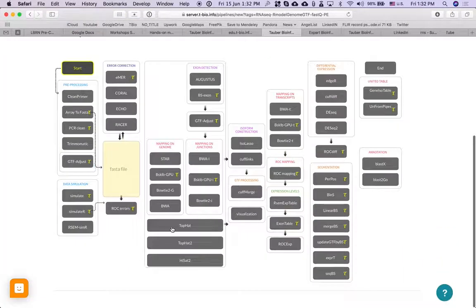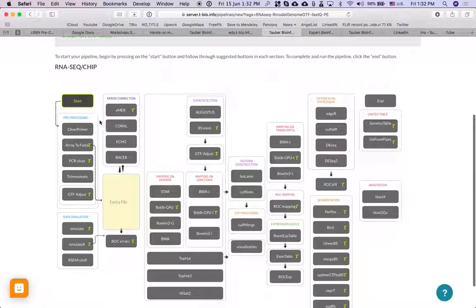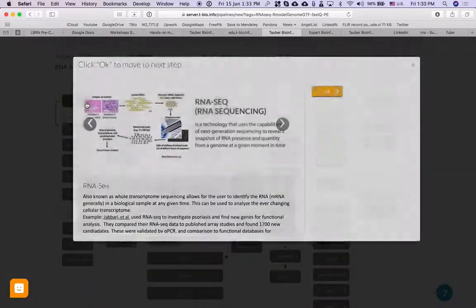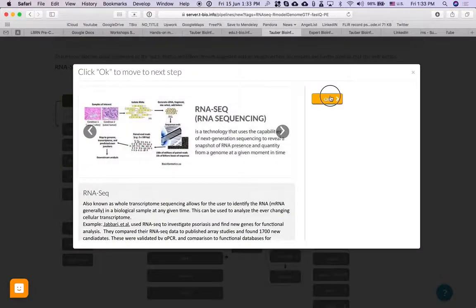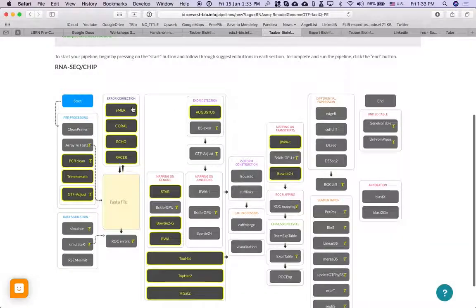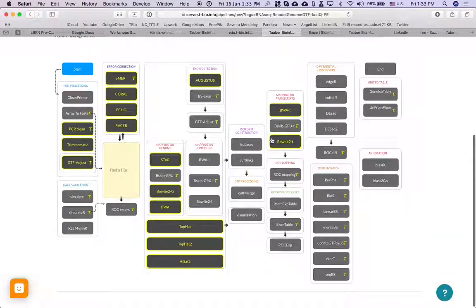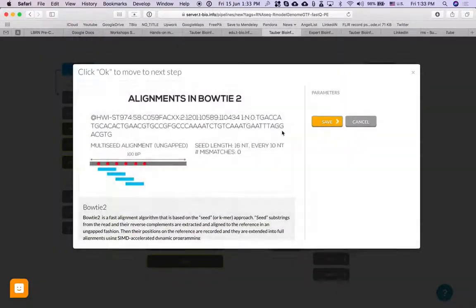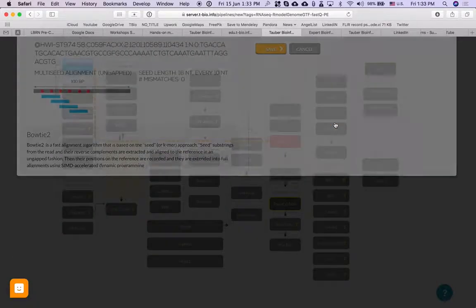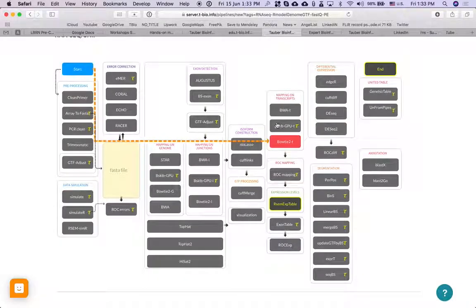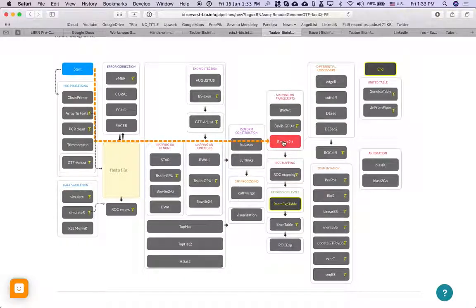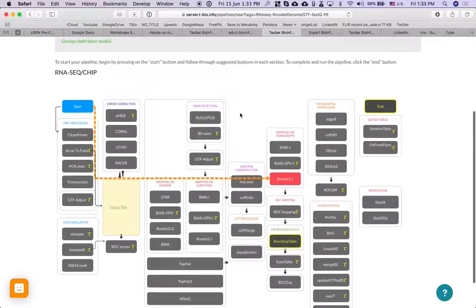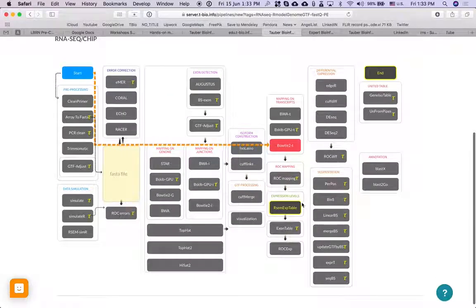And then what I'm going to do is cancel, no groups. So this is what the pipeline should look like. Start, Bowtie2t. I'm mapping on known transcripts that are already in the known genome, in that human genome that I have.